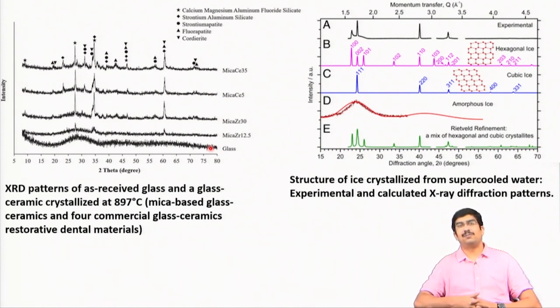Now, glass is a metastable state, a supercooled liquid, and for some glass systems you can promote crystallinity. If you do a secondary heat treatment on the glass, you can develop crystals within that glass itself. So, as you slowly do the heat treatment and slowly increase the crystal volume fraction, you are generating crystals within the glass, and that results in sharp crystalline peaks. You start with the base glass with no sharp peak, and you end with a completely crystalline material with very sharp peaks. If you monitor this process, you can see this change in the corresponding X-ray diffraction profile.